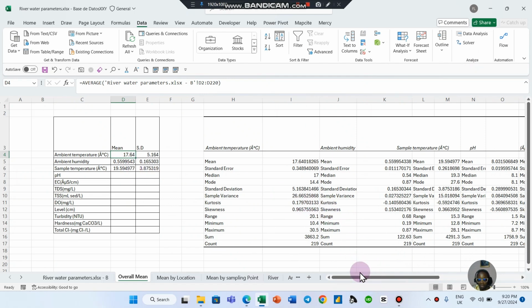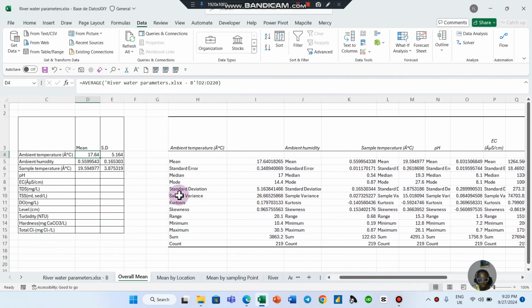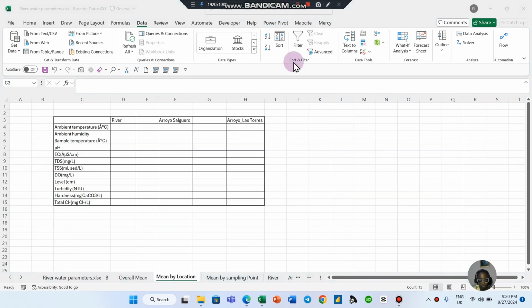So after getting this big table now, you need to create a table in Microsoft Word where you arrange everything very well the way it's meant to be, and all of that.